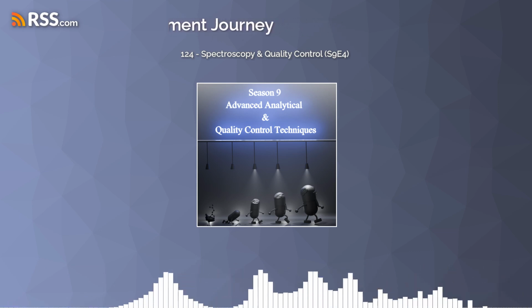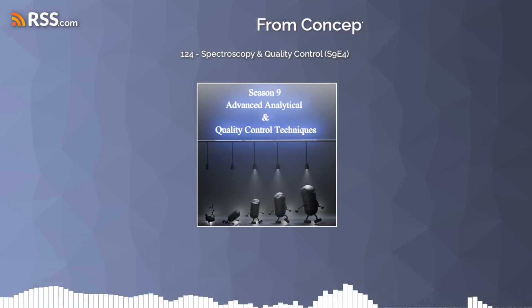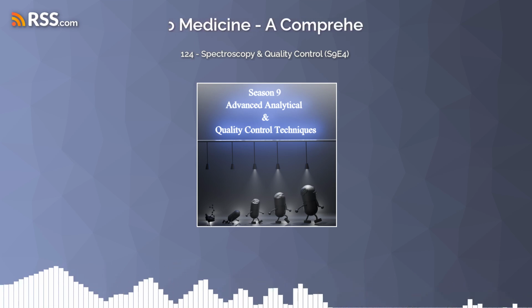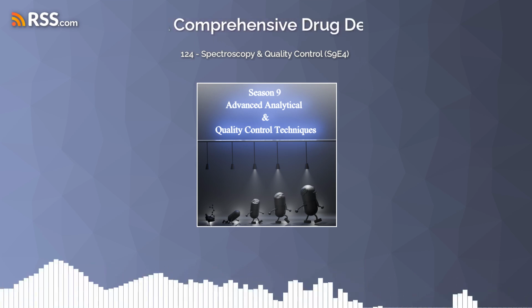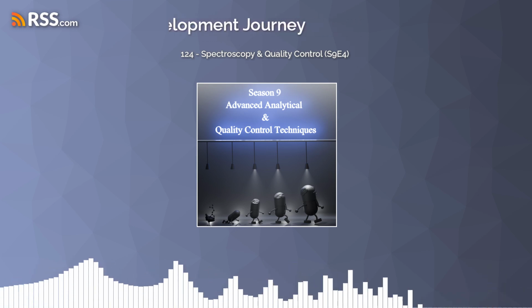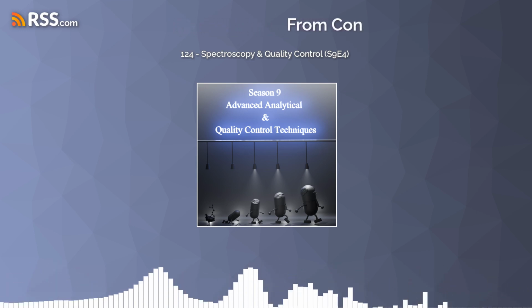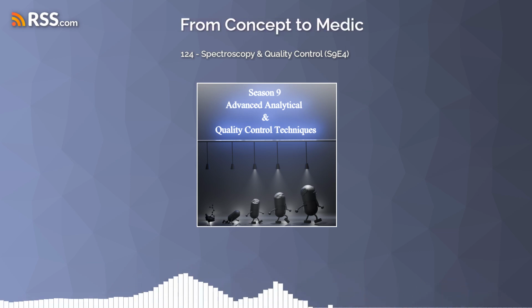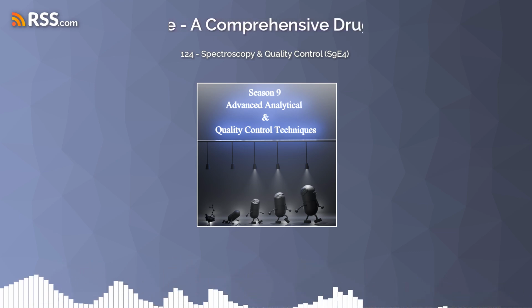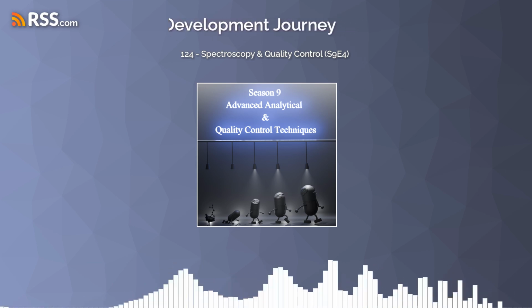And finally, NMR, which we said is kind of the most powerful in terms of structural information. NMR can tell you so much about the structure. How the atoms are connected, the 3D arrangement, everything. But it is less sensitive than the other techniques. So you need more sample. And it takes longer to get the data. So it's not really ideal if you're dealing with very low concentrations or if you need to analyze a lot of samples very quickly. Right, if you're doing high throughput screening or something like that. Exactly. And the NMR instruments themselves are quite expensive.